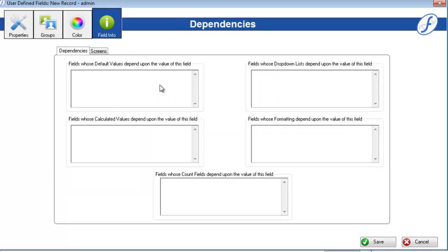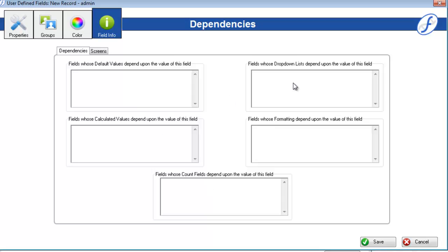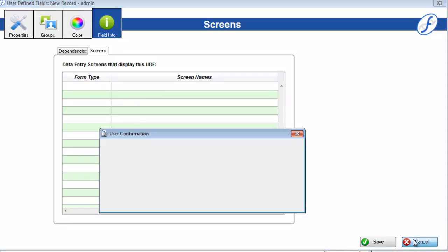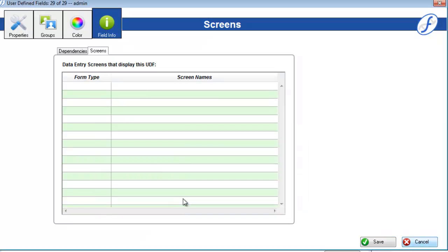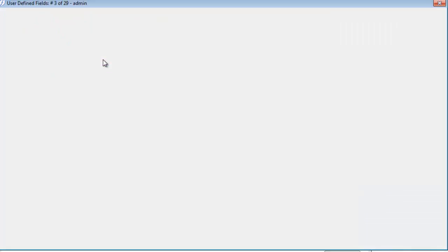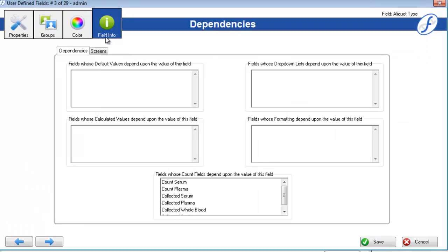The field info page contains two tabs, dependencies and screens. The first one tells you what fields in your database depend on this one for their own default values, calculations, counts, restricted drop-down lists, and color formatting. The screens tab tells you which entry forms have this field on it. Now the field info page will not be useful when first creating a field, but open one after doing some work in Freezerworks and you'll see why it comes in handy.